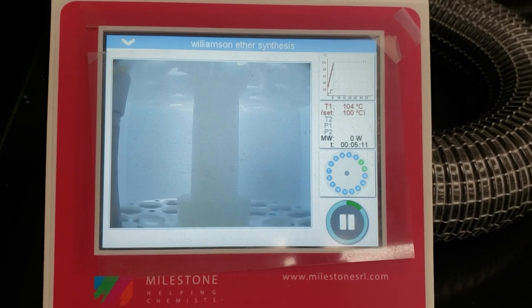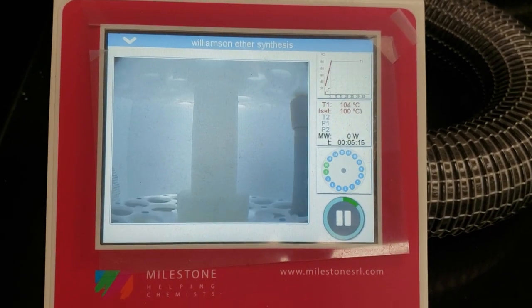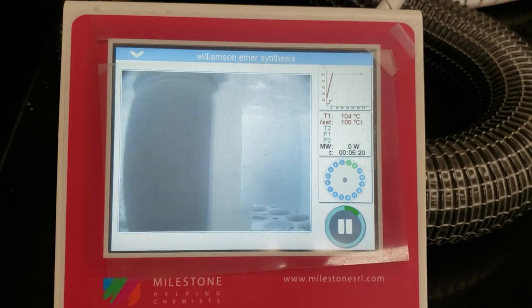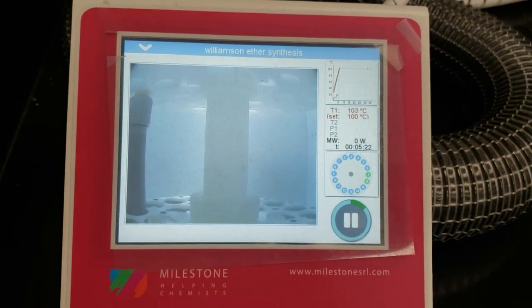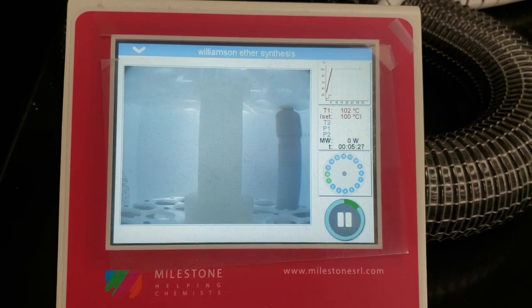There's a camera placed on the interior of the microwave unit that allows us to see what's happening inside. There's our reaction vessel as it slowly rotates through the interior microwave cavity. This allows us to get even heating during the course of the reflux.